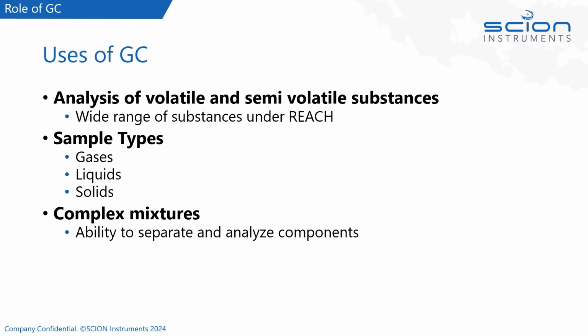We're able to cope with different sample types, so we can analyse gases, liquids, solids, although some sample prep considerations need to be made. This may just be dissolving in a solvent, or maybe some kind of an extraction. We are also able to analyze complex mixtures, so we have the ability to separate and analyze mixtures containing many components, which makes this a really powerful tool.